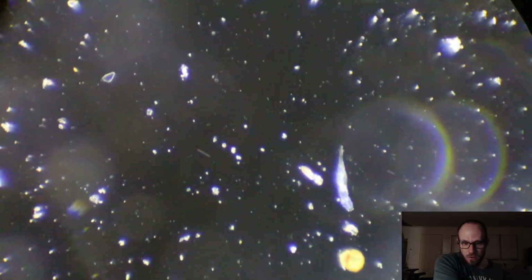There's our guy. I'm losing my... Right is down, left is... Yes, okay. Give us some more light, because he is fading. And he's moving. He's on the move. So this guy is a rotifer.